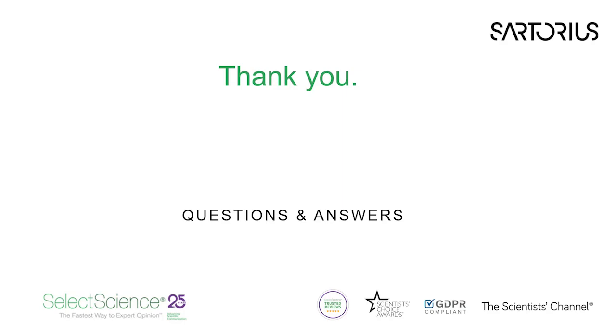Great, thank you a lot for that insight. And I've got another question here about ISO 8655 standards. Does this require the temperature of water to be checked before performance checking pipettes internally between calibrations? I'm going to have to come back to you on that one, because there is something about temperature, but I cannot answer that question without checking. I don't want to give the wrong answer. Can I come back to you on that question? Yes, that's completely fine. You can follow up with the attendee by email after the webinar. So I'll move on to the next question.